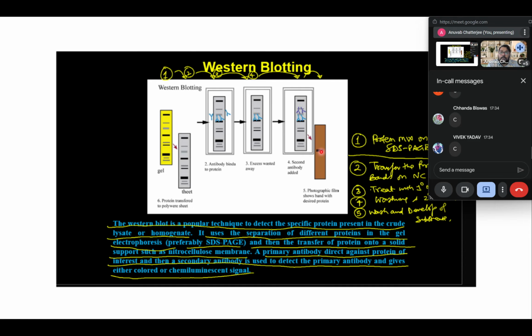So how do you do gel electrophoresis on a protein? Because obviously, when you attach the negative to one side and the positive to the other, positive proteins will travel on one side, negative will travel on the other side. You will never be able to figure out what the weight of the protein is.